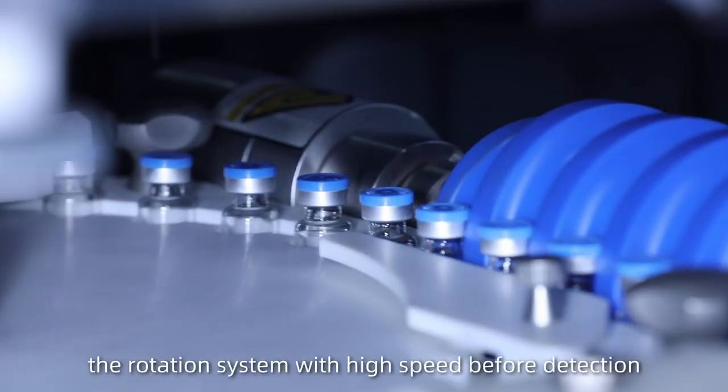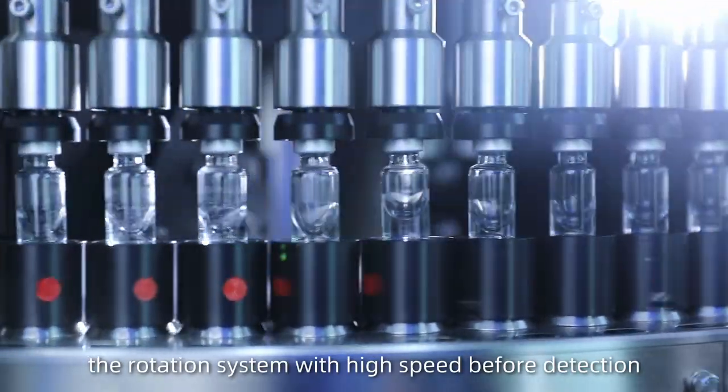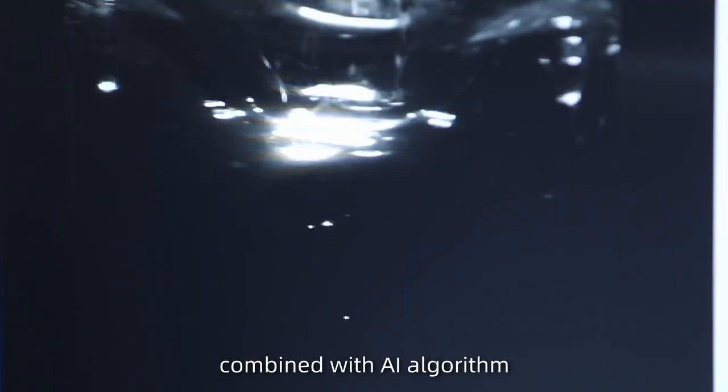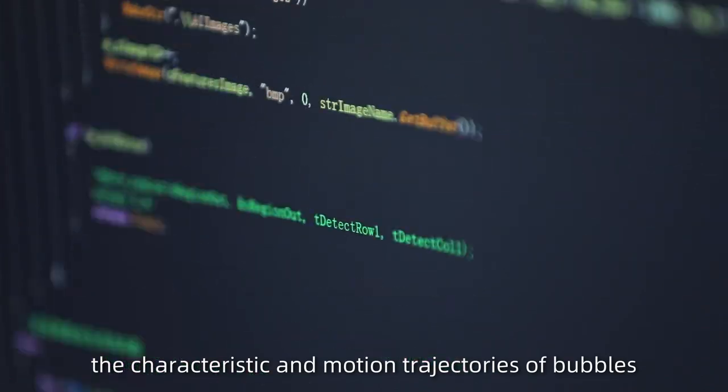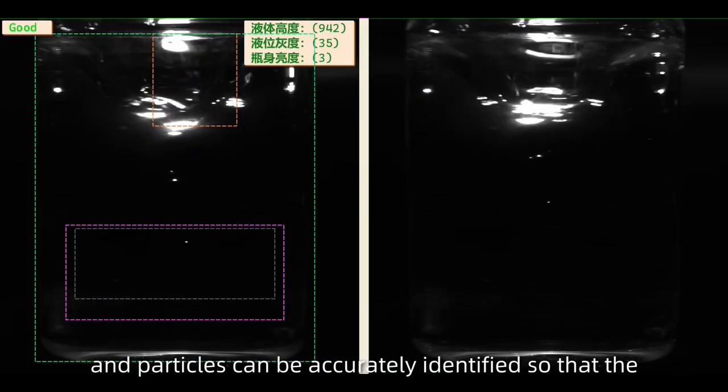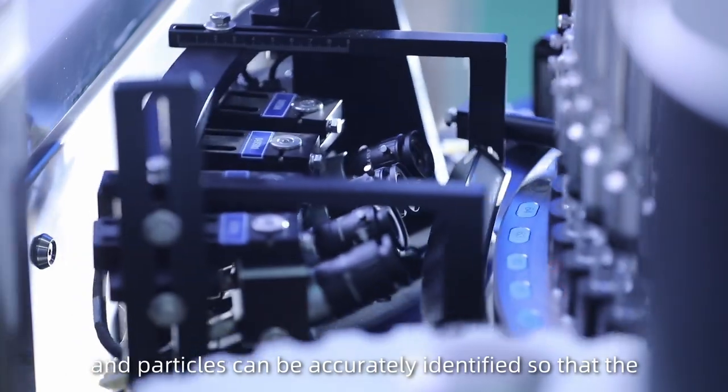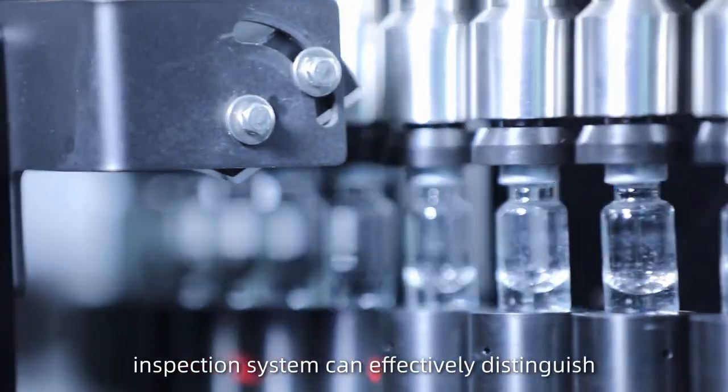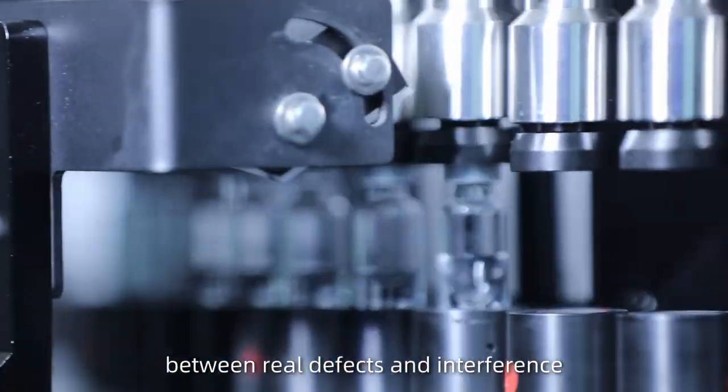At the same time, the rotation system with high speed before detection can reduce bubbles. Combined with the AI algorithm, the characteristics and motion trajectories of bubbles and particles can be accurately identified so that the inspection system can effectively distinguish between real defects and interference.